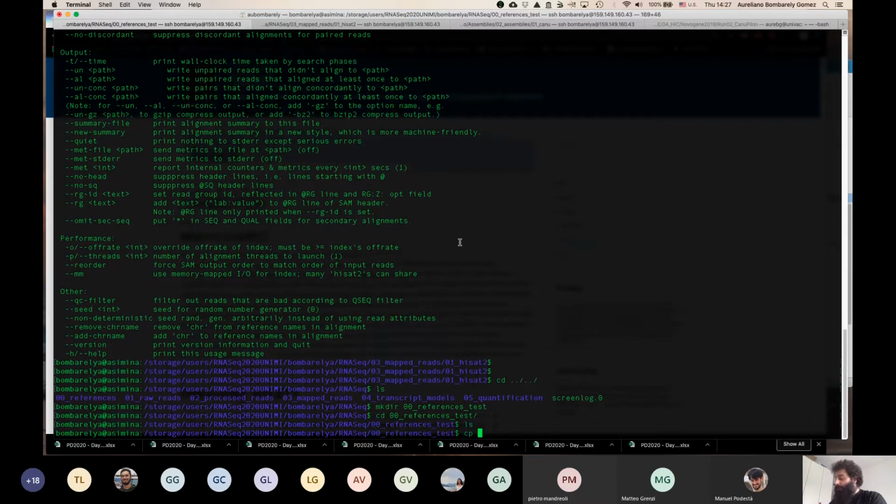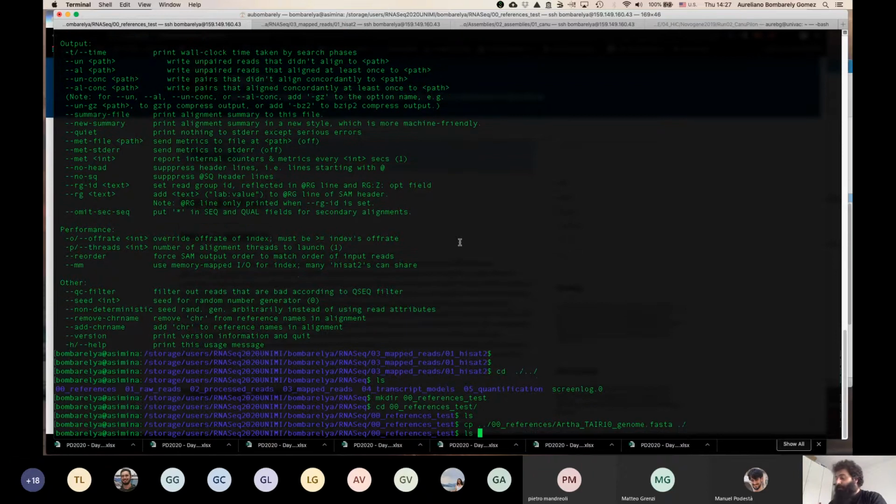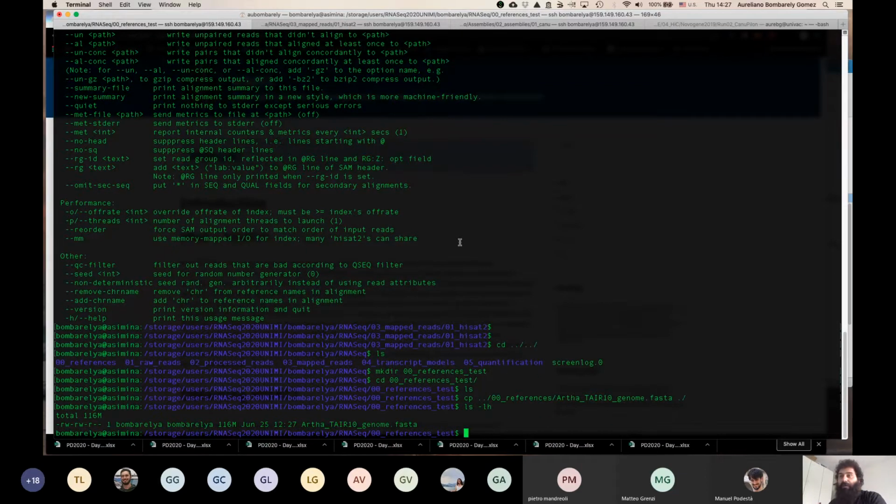Let me copy from references the reference. So now I should have the reference.